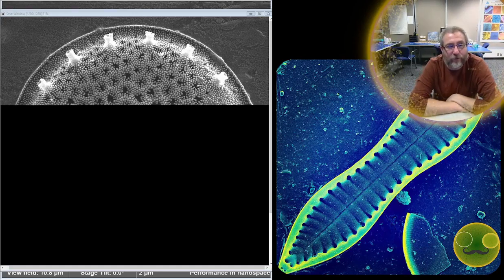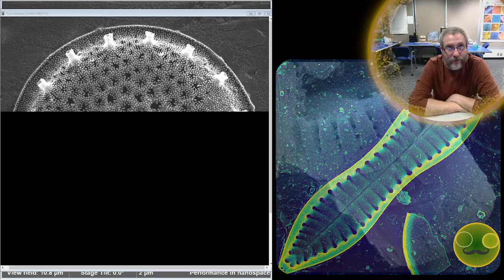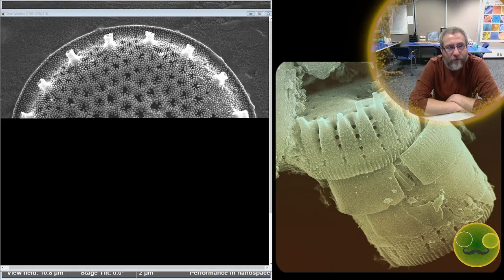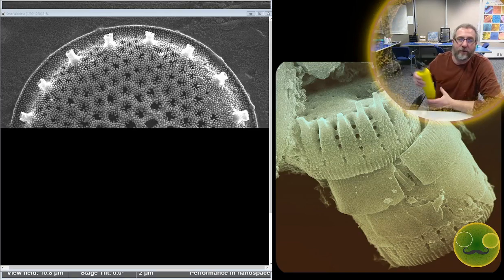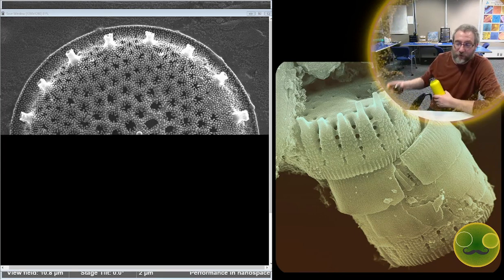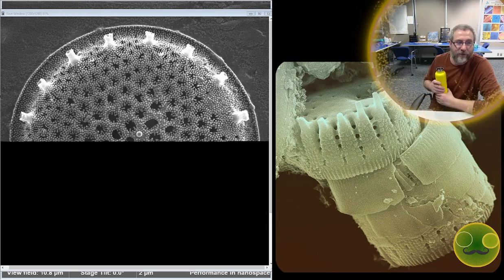So I put some samples in here from these 10 million year old diatomites that I've been looking at from Lake Idaho. It's been maybe like a year since we've looked at any of those diatomites, but I obviously could always spend a bit more time looking at any of those samples just to sort of see what's going on in them.